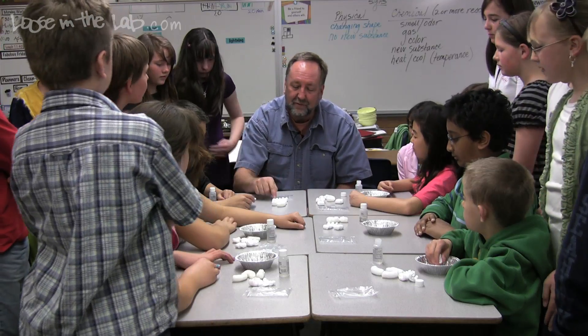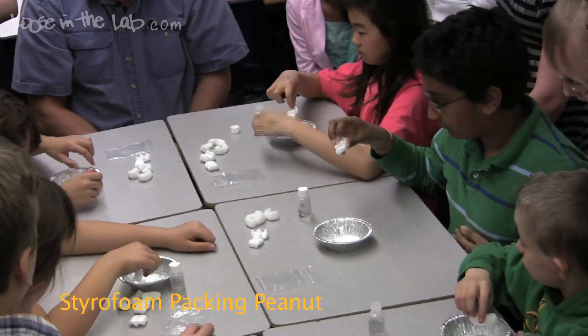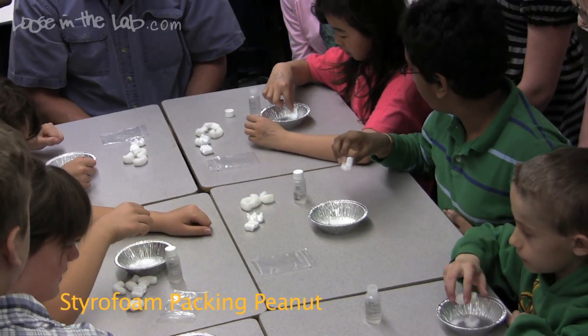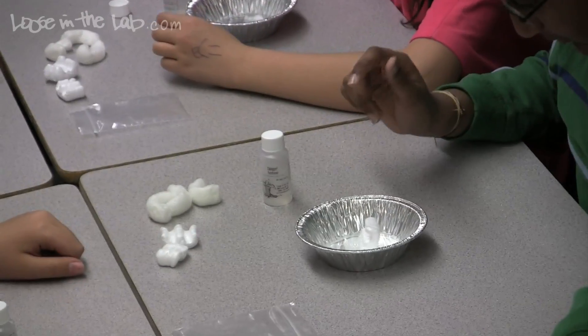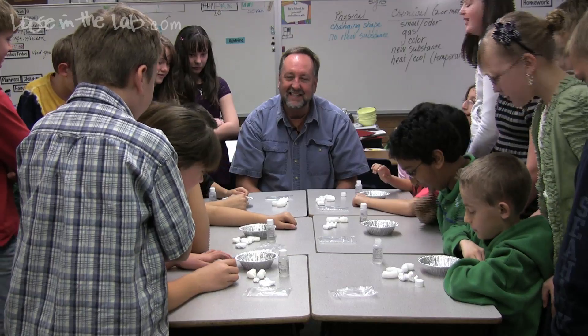Now find the styrofoam peanut, put it in the acetone, and tell me what happens to it. Does it stay whole, or does it dissolve? It dissolves — okay. That was crazy! It just disappears like crazy.